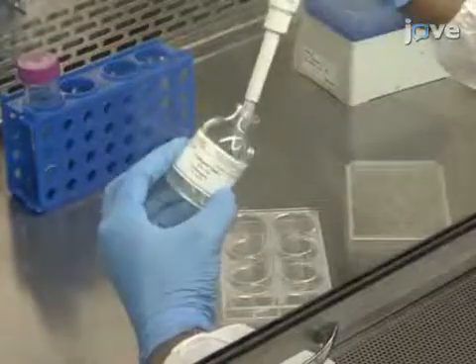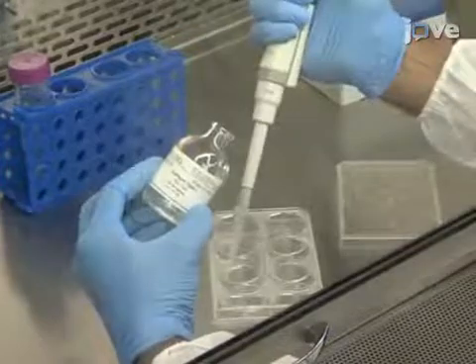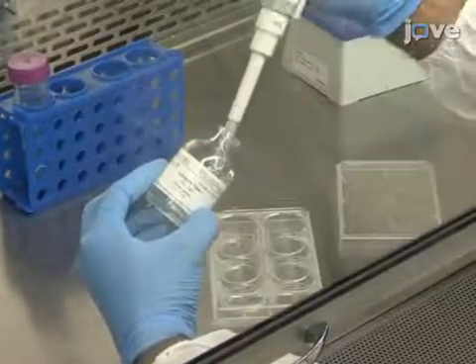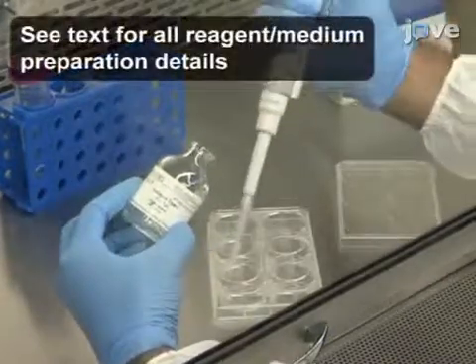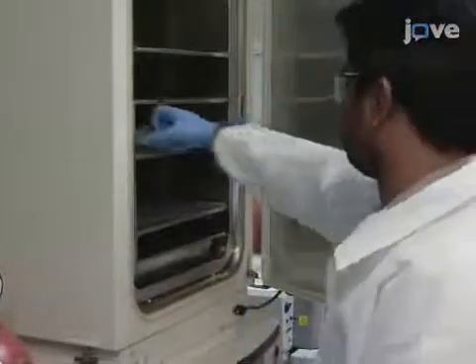Before beginning the isolation procedure, pre-coat six well plates with two milliliters of freshly prepared Rattail 1 collagen solution per well. Equilibrate the plate in a 37 degrees Celsius and 5% CO2 incubator for at least one hour.